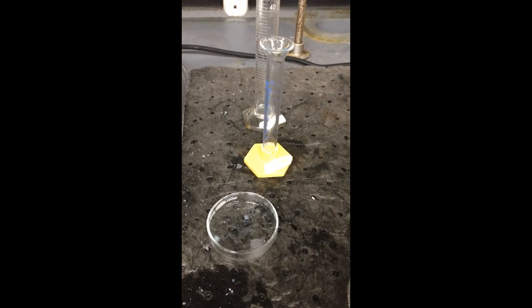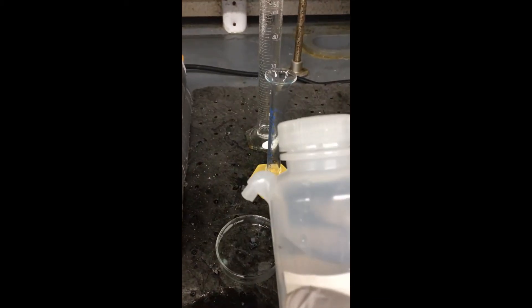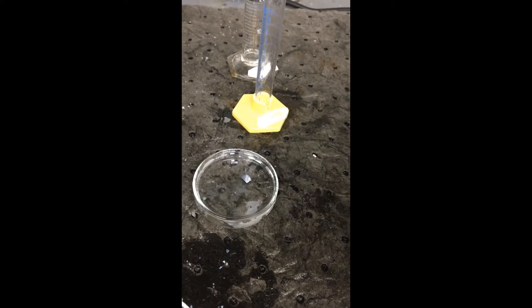Now that I have removed my wafers and placed them in this glass petri dish, I'm going to take some DI deionized water and wash them off to get some of the acid off.